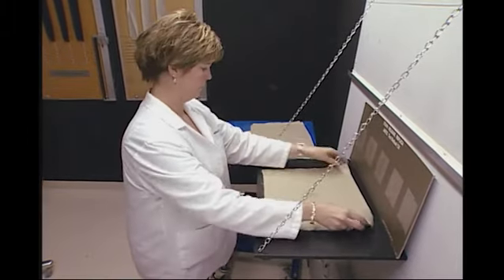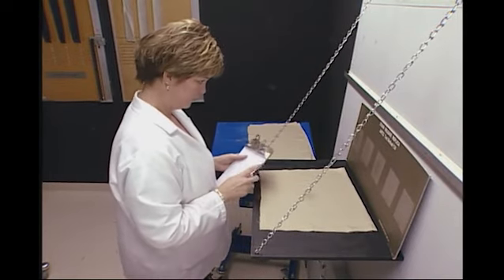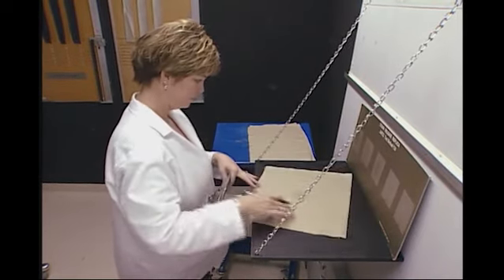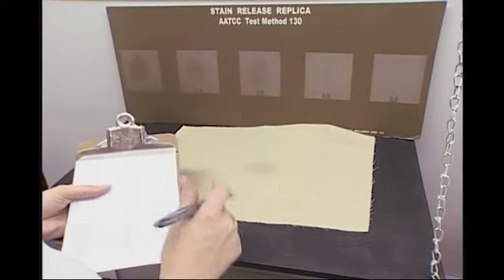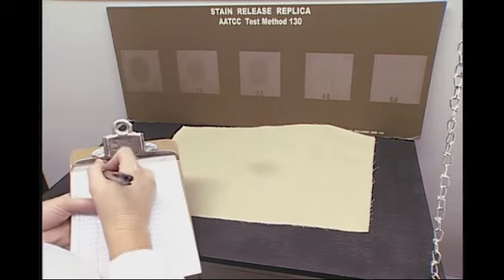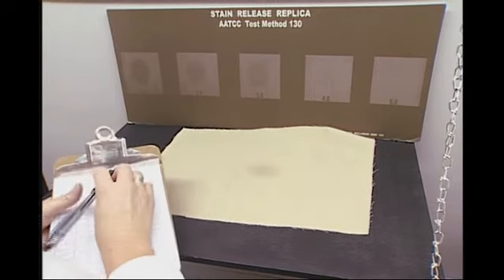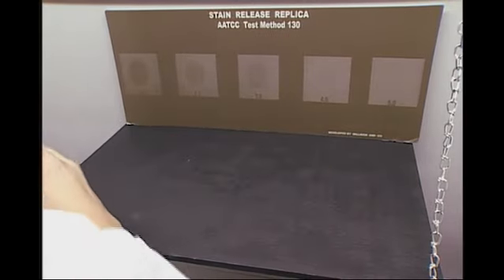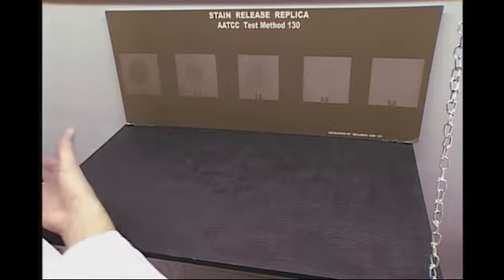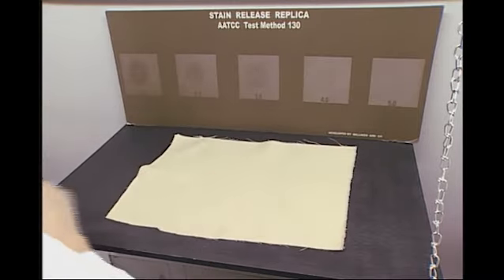The test specimen is placed flat on the black surface and is rotated to be viewed in the direction that produces the lowest rating. The rating scale shows images that represent poor stain removal to little or no visible stain remaining. Grade 1 is the poorest stain removal rating, followed by increasing steps of successful stain removal to grade 5, which represents the best stain removal performance. Observers may also rate to the nearest 0.5 grade level.